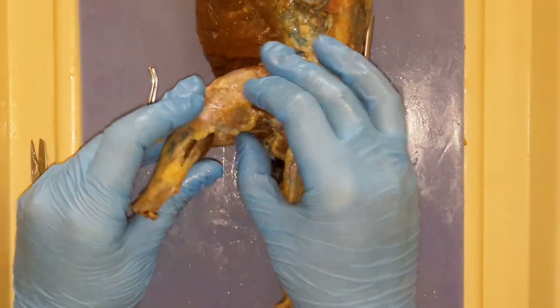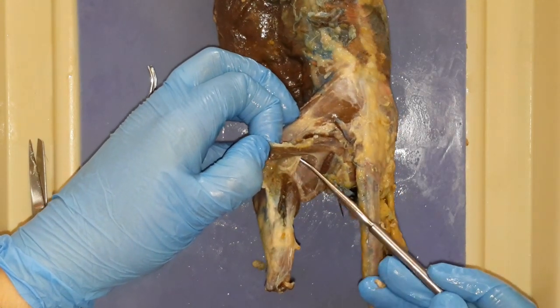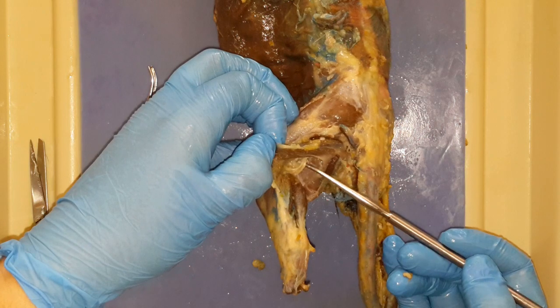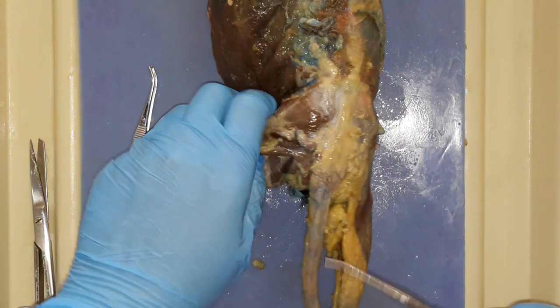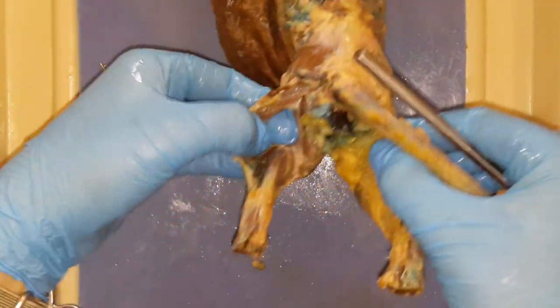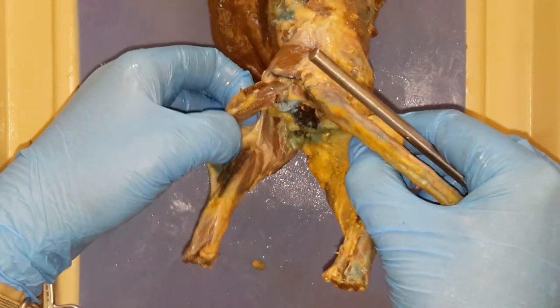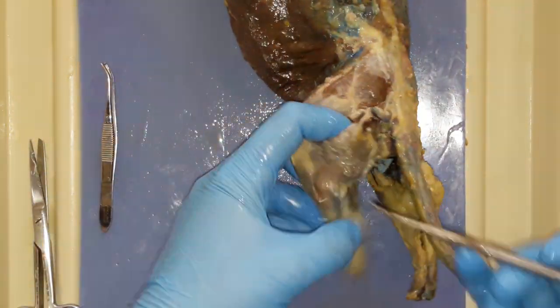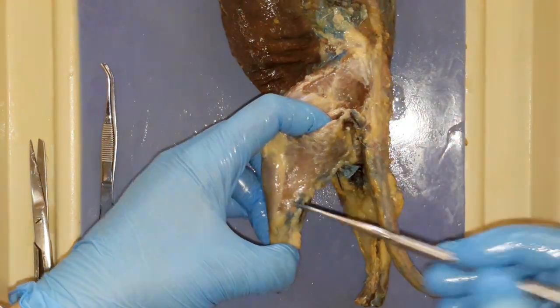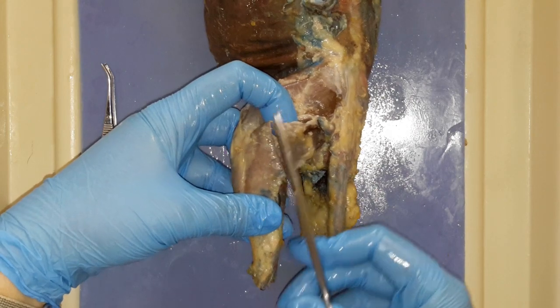Before we do a bisection, we want to check and look for the sciatic nerve. Underneath the bicep femoris is your sciatic nerve. I told you before that it's a bundle of two nerves, so you can see it's already split right there — you can see the two nerves. The sciatic nerve is actually a bundle of the common peroneal or fibular nerve and the tibial nerve. Once you see that it is safe and you're not going to bisect it, use a probe or your finger, make sure it's holding it down — see, it's under my finger — then we're going to bisect it right through the middle. Note that this bicep femoris does attach along the lower limb. We're going to bisect it right in the middle, preserving our sciatic nerve.